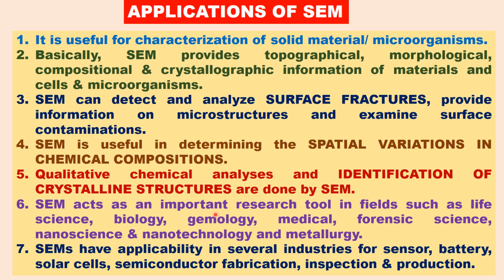SEM is an important research tool in various fields such as life science, biology, gemology, medical, forensic science, nanoscience, nanotechnology, and metallurgy. SEM has applicability in several industries including sensor fabrication, batteries, solar cells, semiconductor fabrication, inspection and production.